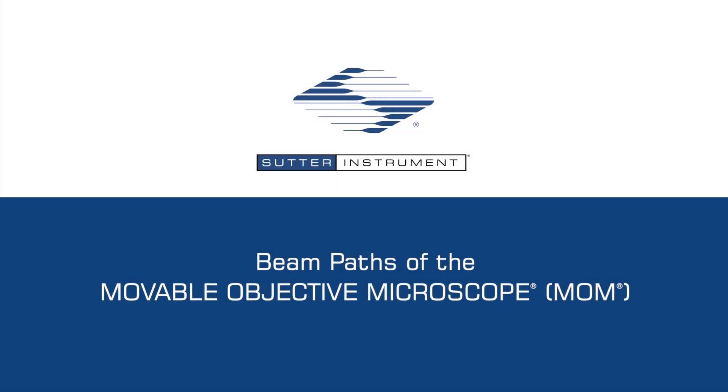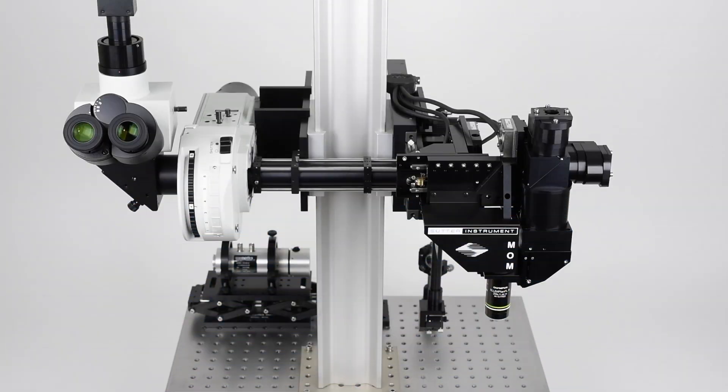This video highlights multiple beam path options in the Sutter Instrument Multi-Photon Moveable Objective Microscope. Please note that the table optics shown here have been simplified.